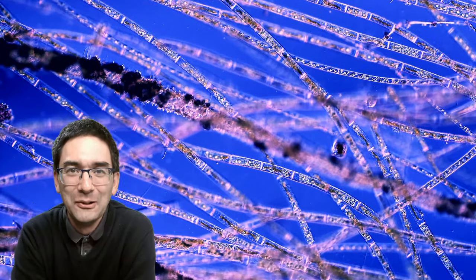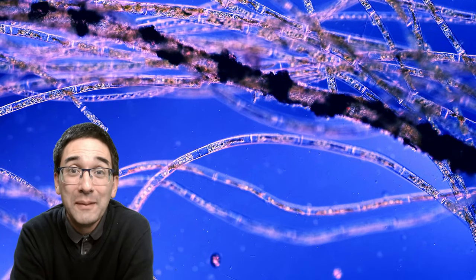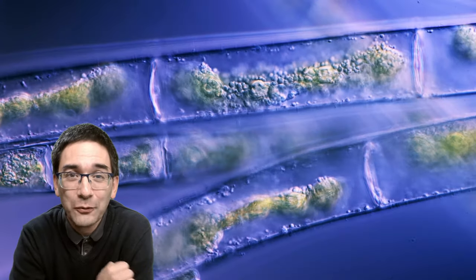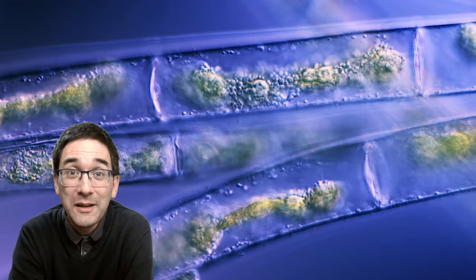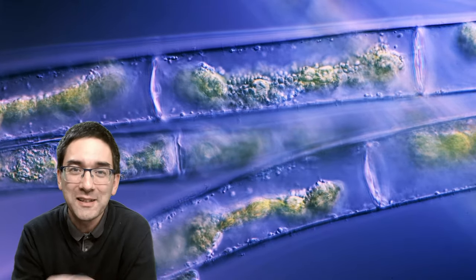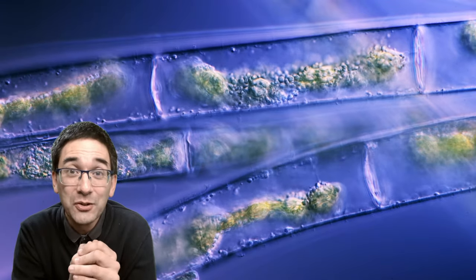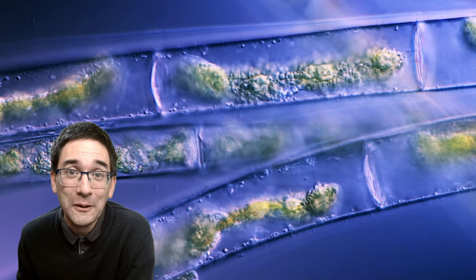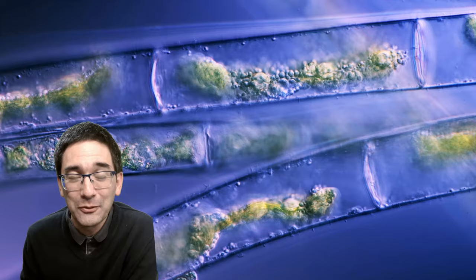Now let's have a look under the microscope. As we know, filamentous algae produce quite a bit of oxygen. If you look carefully into the cells you can see the green chloroplasts moving, and not just the chloroplasts — there are a whole bunch of vesicles transporting substances. There's quite a bit of biological activity going on, which can be observed nicely under the microscope.